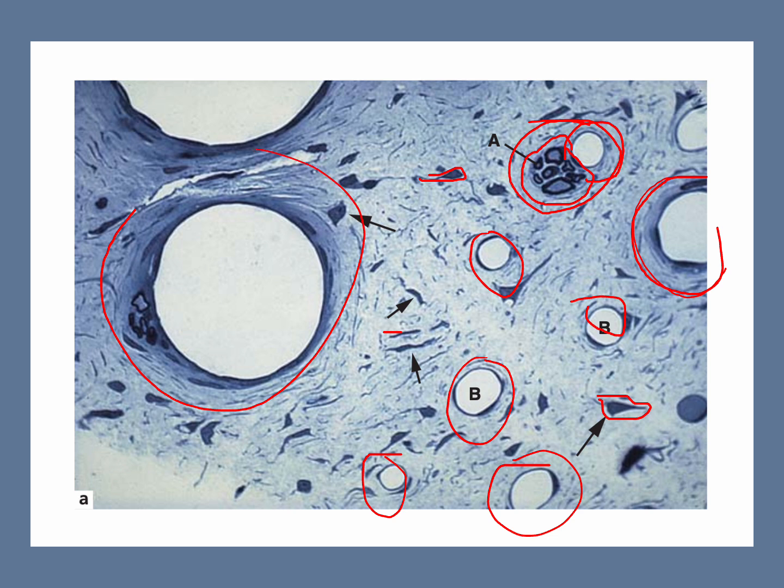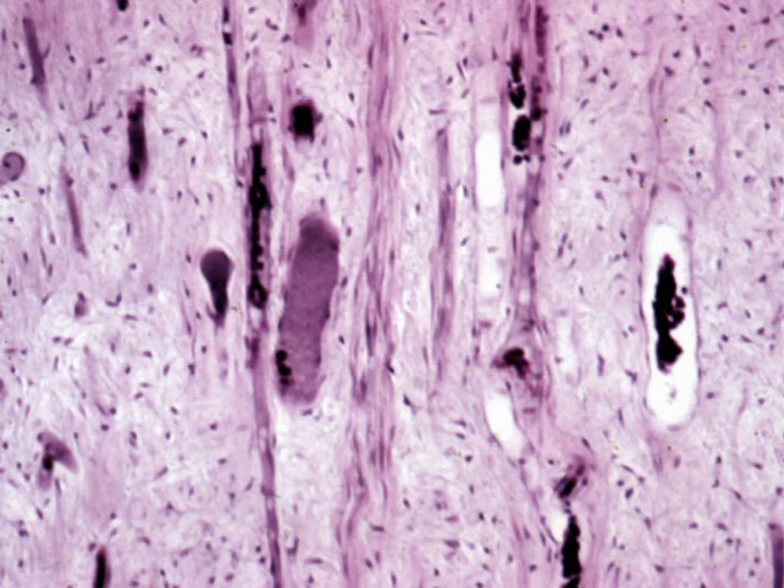This is a neurovascular bundle. This is the nerve part. Why is it so small? Sometimes it depends on the angle that we have cut the tissue with. And this is an arteriole. You can see smooth muscles around it. Again, in this section, we can see all these beautiful fibroblasts lying in the extracellular matrix.